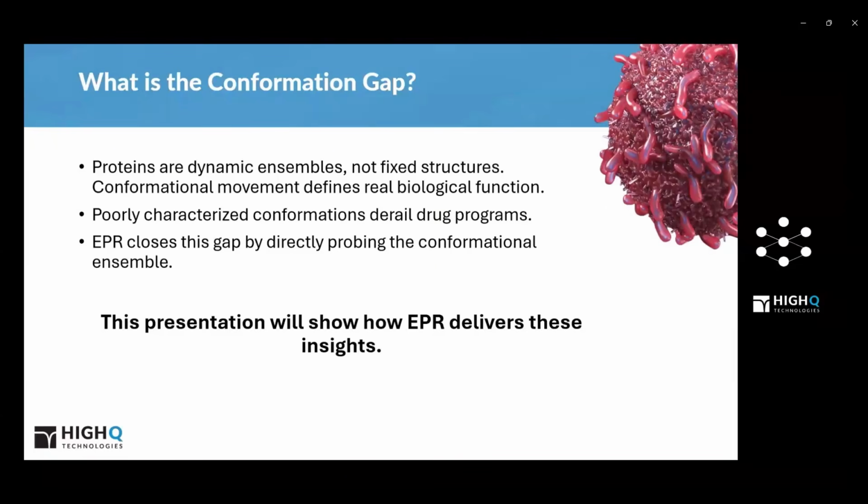These systems are constantly moving, shifting between conformations, interacting with other proteins, with nucleic acids, with small molecules. So it puts a nuance on the classic structure-function paradigm, where structure and dynamics really define the function. This helps us get a full picture of what a particular system is doing.